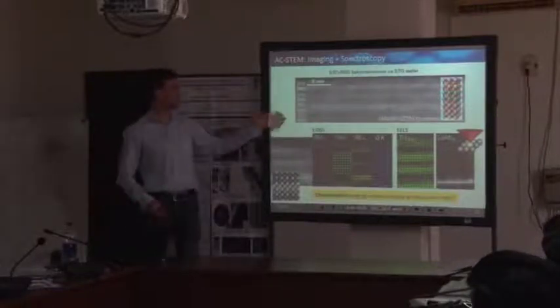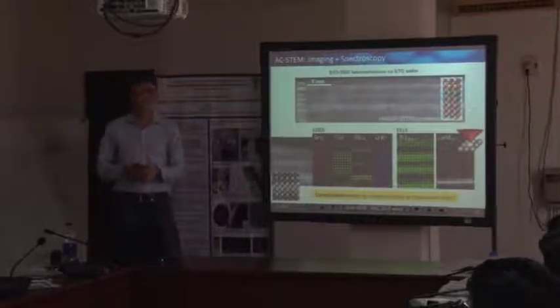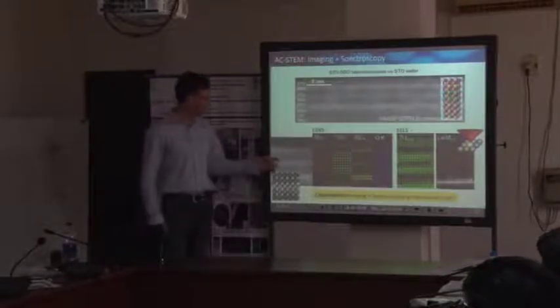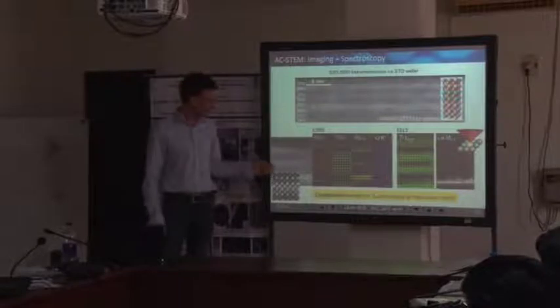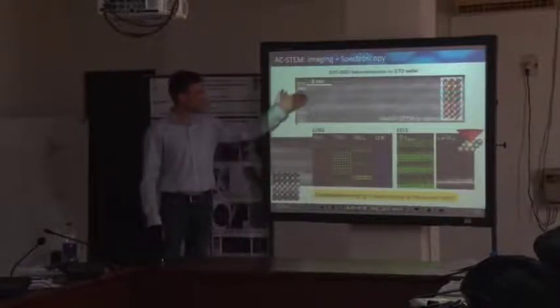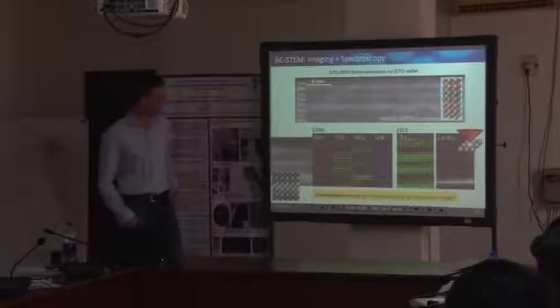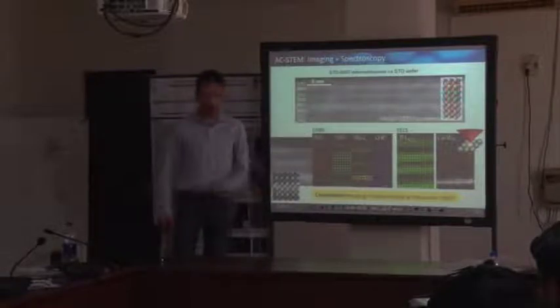So this is what I did at Stanford. Without, they just have an image Cs aberration corrected microscope, which is dedicated for environmental measurements. So they have a gas inlet. This was a probe corrected microscope in the HP lab in Silicon Valley. So they have a double aberration corrected tool available. In principle, this is exactly the sample, just in a different site. And this is the combined EDS and EELS measurement.